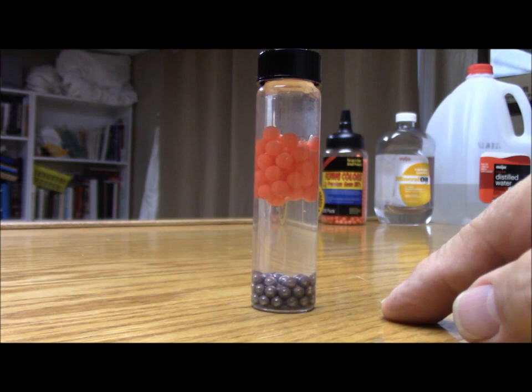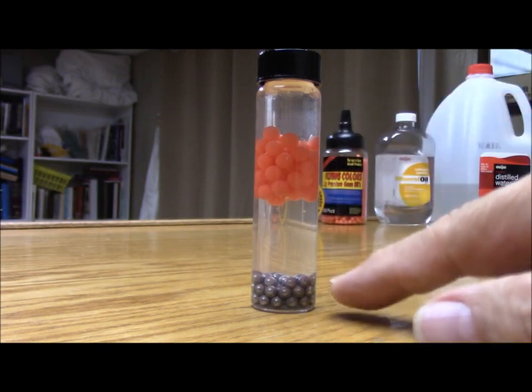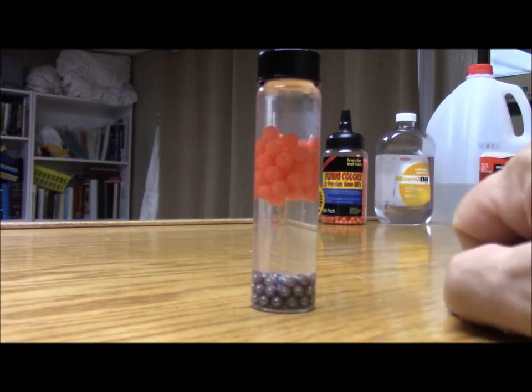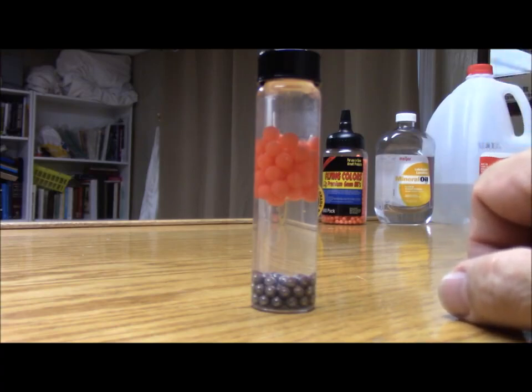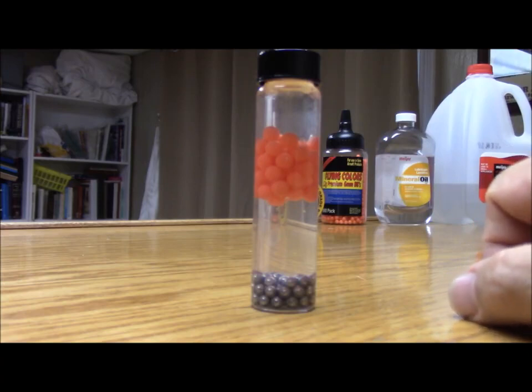So the first question on the backside, which of these phases in this vial is the most dense? So, write out your answer. Which of the phases, and there are 4 phases, which of those is the most dense? And then the next question, which of the phases is the least dense? Okay? Then we go on.